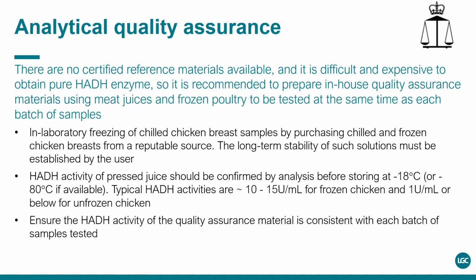These reference materials may be employed for control purposes to confirm that the absorbance readings are optimized. It is recommended that the HADH activities of each sample be recorded and then a vial of each solution analyzed with every batch of samples to demonstrate consistent results.